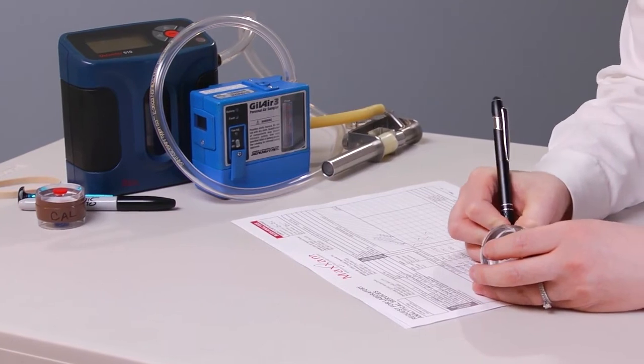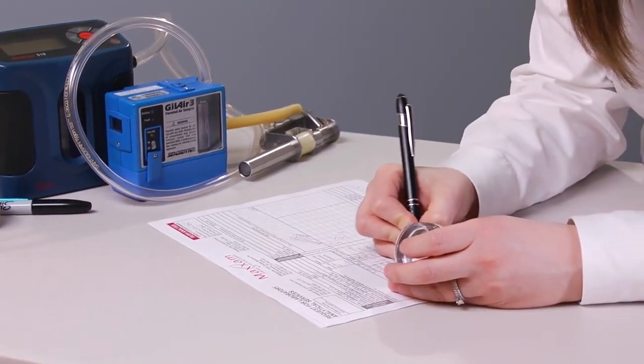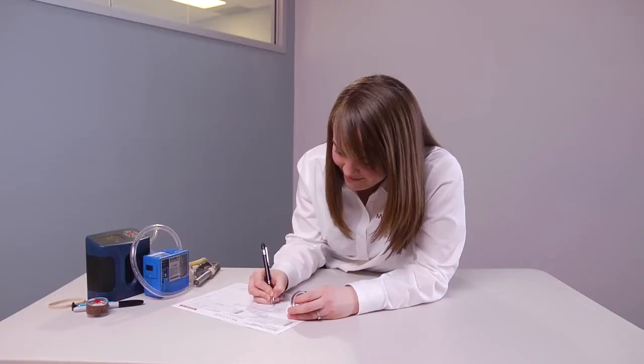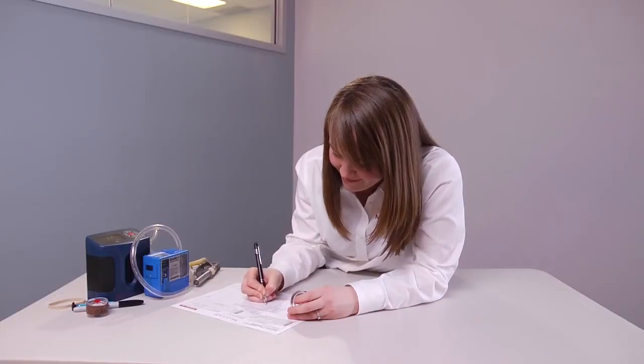Finally, complete the laboratory request form, also called the chain of custody, noting that the samples were collected as respirable and the analysis needed. Return the filters to the laboratory for analysis.